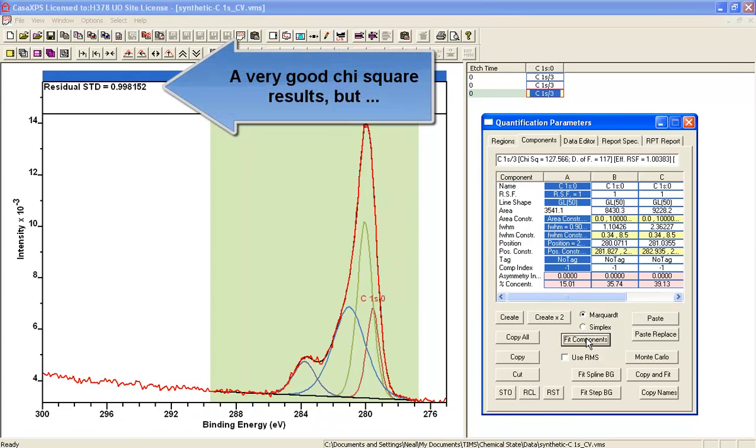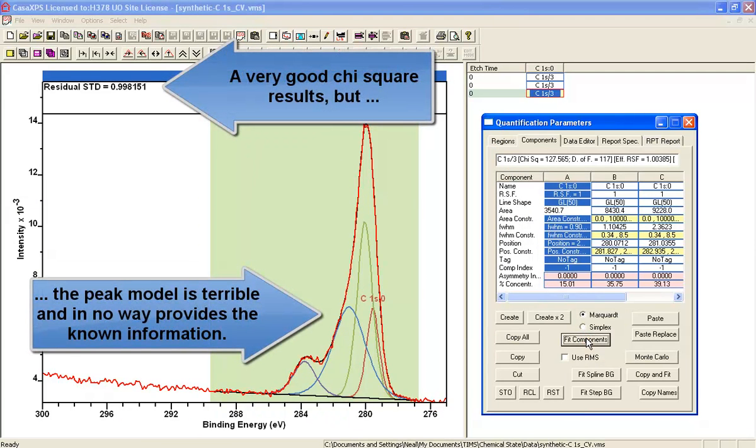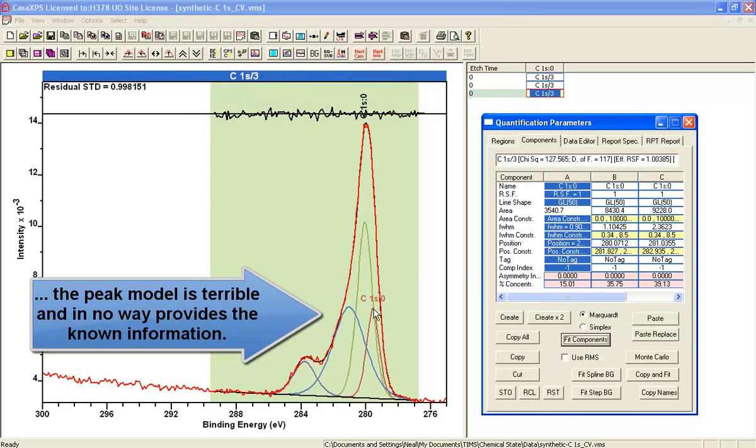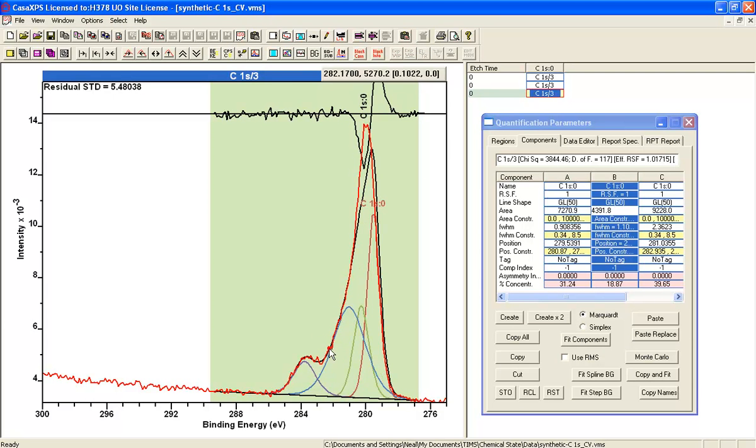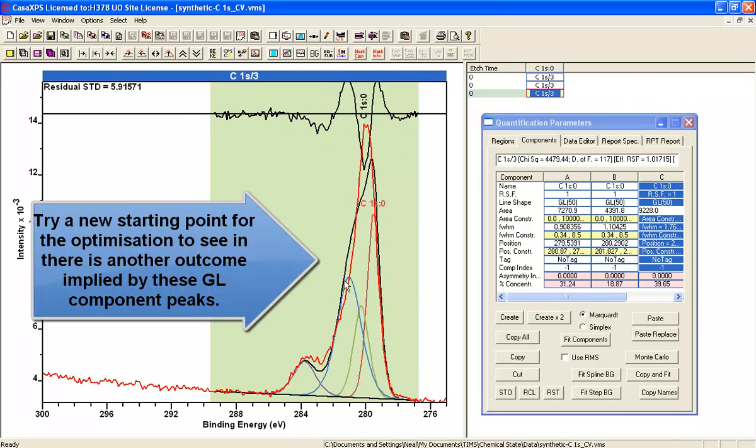And when we do the fit, again, fantastic residual standard deviation. It should be about one and it's come up slightly better than one. But the peak model itself is rubbish. There's nothing here that would be useful in terms of physics or chemistry.